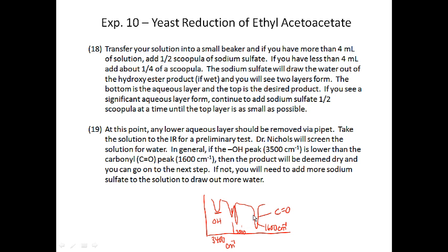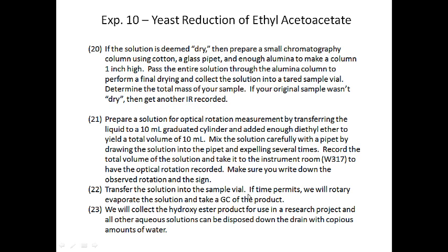If your OH is less than your carbonyl, I'll say okay. If it's a little bit bigger, then we'll add some more sodium sulfate to it. So that's what I mean by deemed dry. It's not completely dry, but it's going to be as dry as we can get it. Once the OH is smaller than the carbonyl, then you're going to go on to the next step. If it's not, you're going to add more sodium sulfate, and I'll probably reanalyze and see what we find.